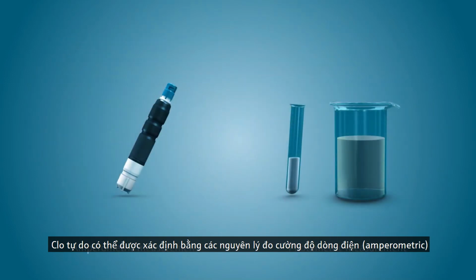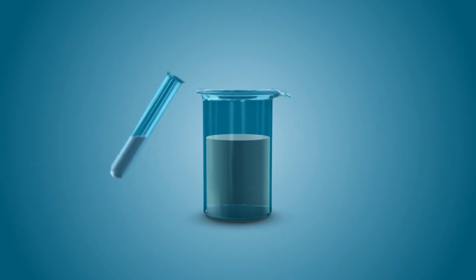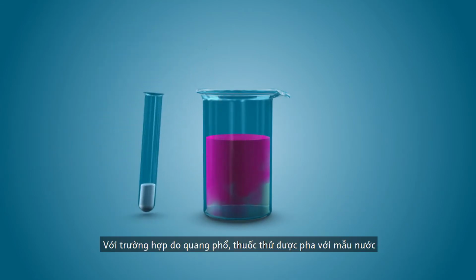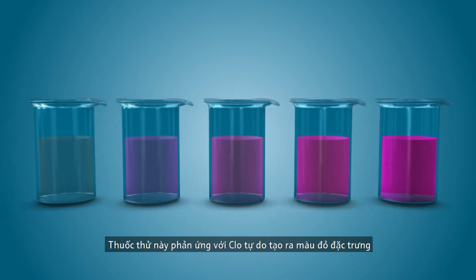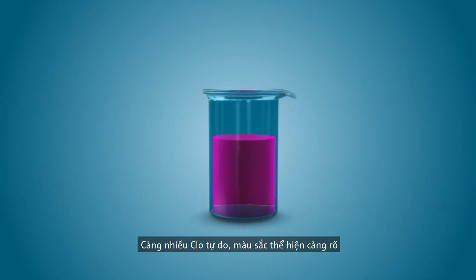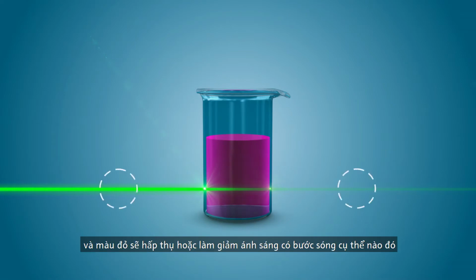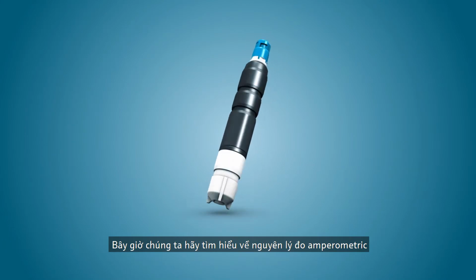Free chlorine can be determined using the amperometric or photometric measuring principles. In the case of photometric measurement, a reagent is mixed with a water sample. This reagent reacts with the free chlorine, which results in a specific reddish sample color. The more free chlorine that is available, the higher is the color intensity. This color intensity is then measured based on the fact that the reddish color absorbs or attenuates light of a specific wavelength. Let's now concentrate on the amperometric measuring principle.